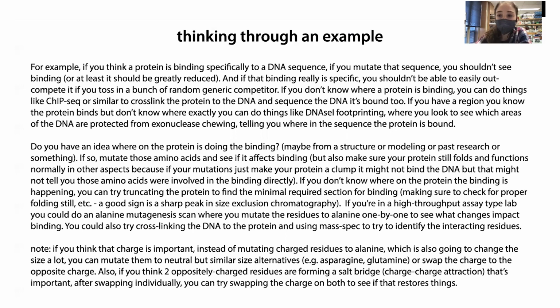One of the things that's important when we're talking about protein-nucleic acid or protein interactions is that you need to make sure you have enough salt. Salt can act as a kind of non-specific competitor. So if you have no salt, or really, really low salt, the protein will form more interactions than it normally would.